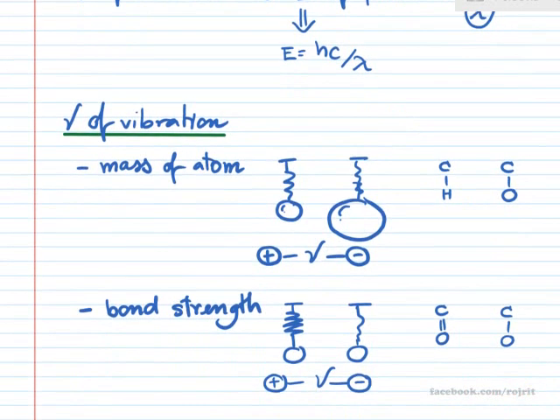So you can then excite the stretching of the spring by different frequencies of the IR as well. A higher frequency of IR can excite the double bond, but in order to excite a single bond, you require a lower frequency of the IR spectrum, things like that.